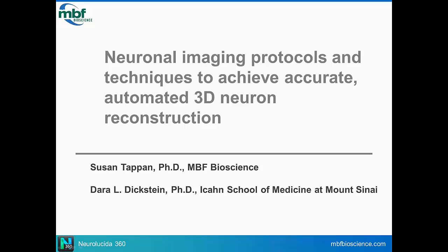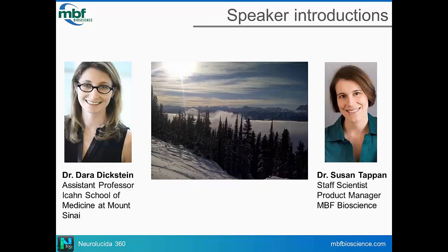I'm joined by Dr. Dara Dickstein, an assistant professor at the Icahn School of Medicine at Mount Sinai. Today we're going to be discussing how to prepare your tissue with automated reconstruction in mind. In addition, I'll be showing off our latest software for automated neuronal reconstruction, Neurolucida 360. I've had the pleasure of working with Dara for the past few years on this particular project, and I'm thrilled to be presenting this webinar with her today.